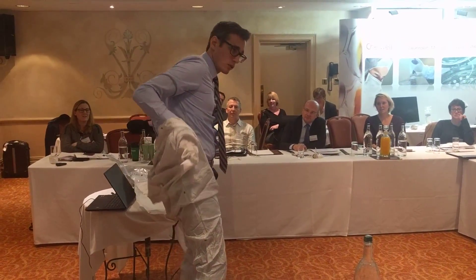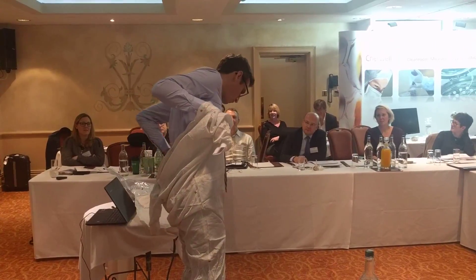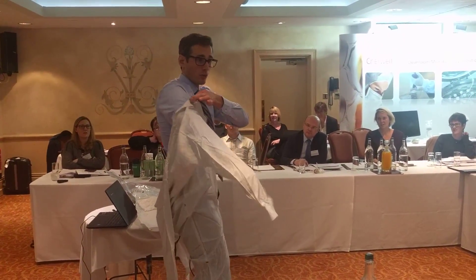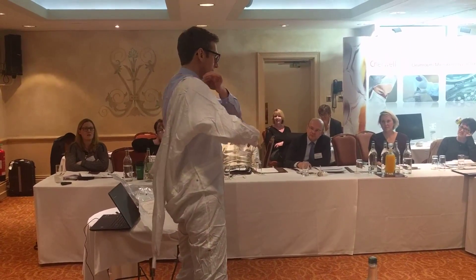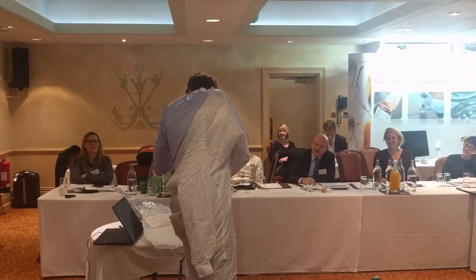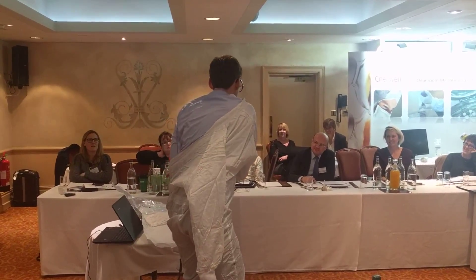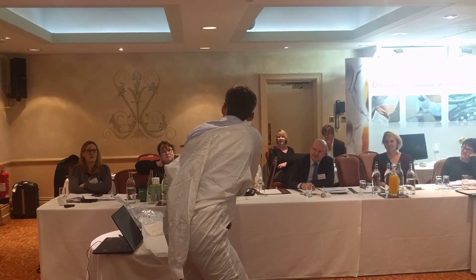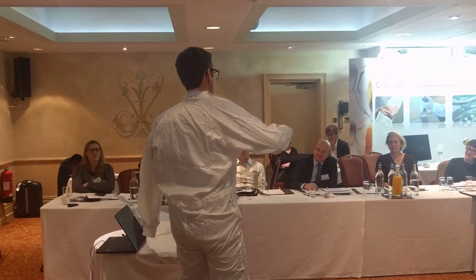Then, to continue with the sleeve side, concentrate on one side after the other — to always take control of what I'm doing, of what happens. Don't wear ties as undergarments. This is a critical part of the technique; it's hard to take control of the second side because it tends to turn inside.